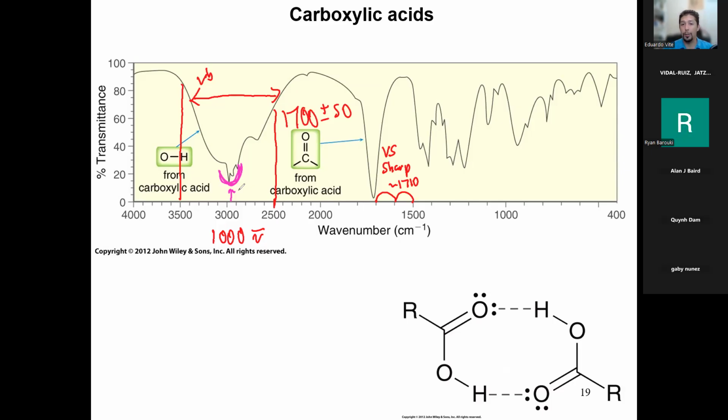All molecules have them. You have an answer? It is CH stretch. Yes, exactly. These are your CH stretches. In this case, we're not actually given a formula, so we don't know what kind of CH stretch it is. You could just tell me this is a CH stretch right there.